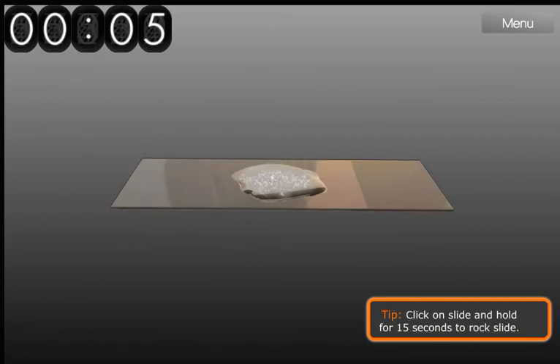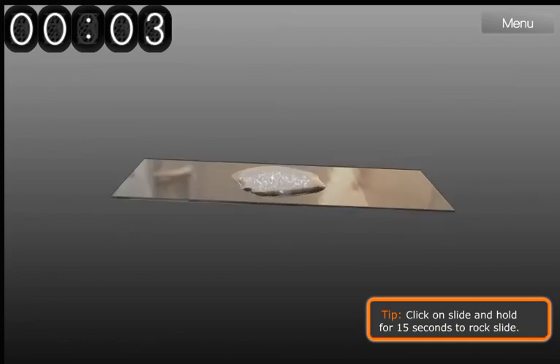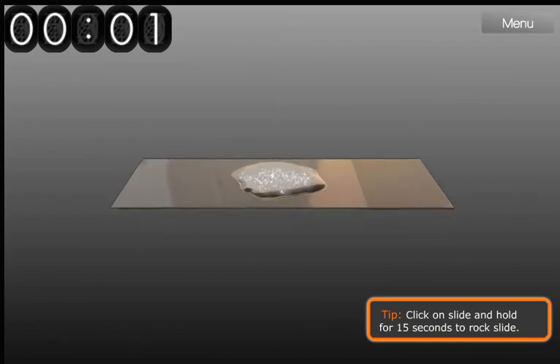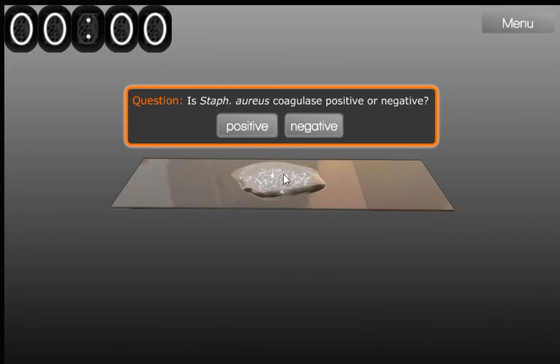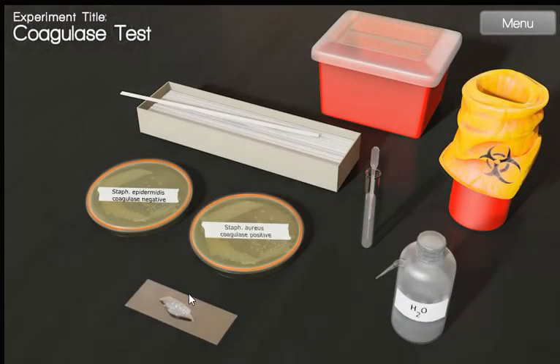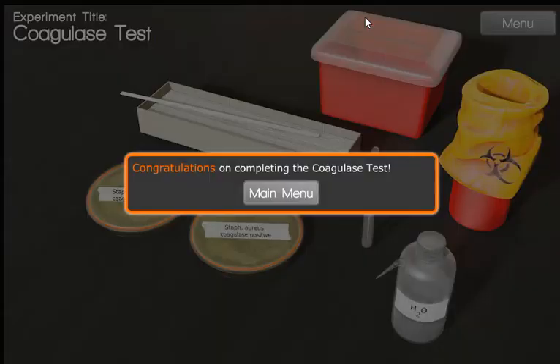We can see that our drop became solid, with some pieces of solid in the liquid drop. We choose positive result and it's the correct answer. We complete the Coagulase test.